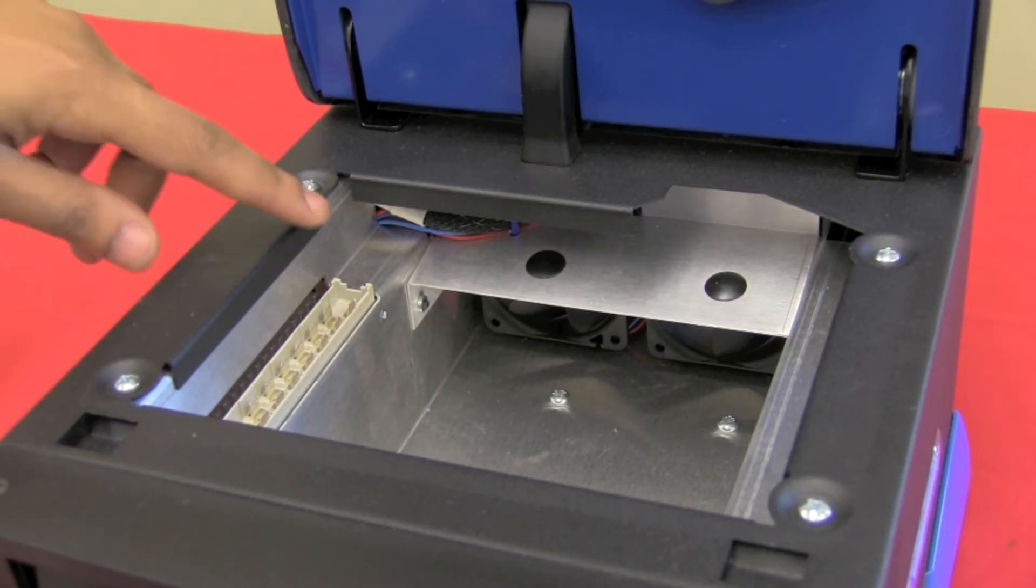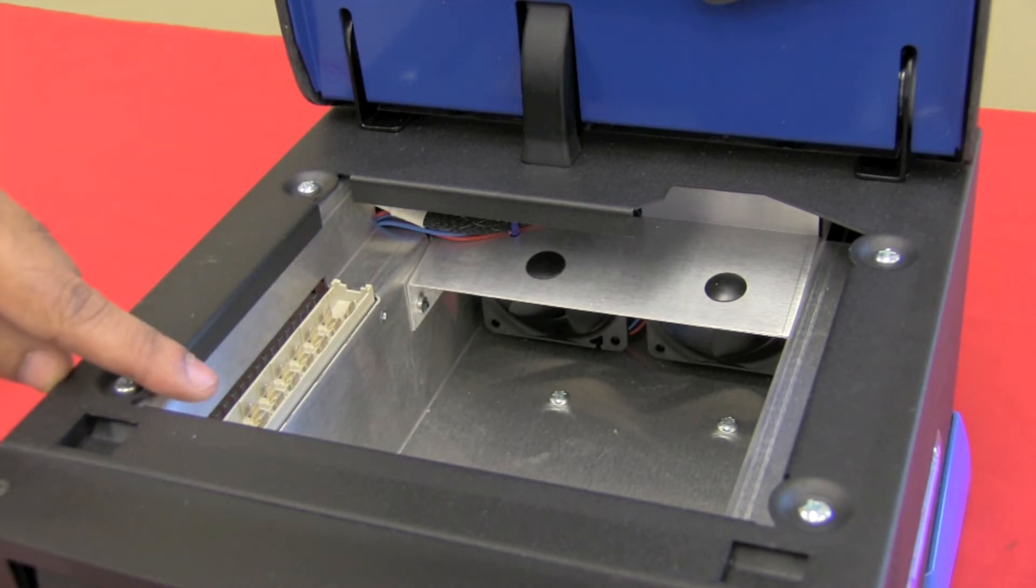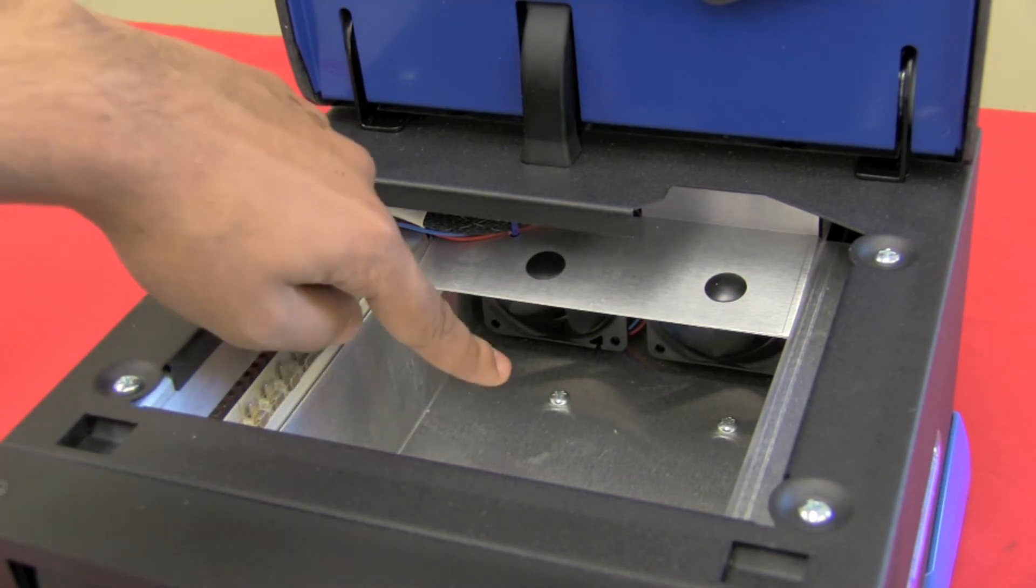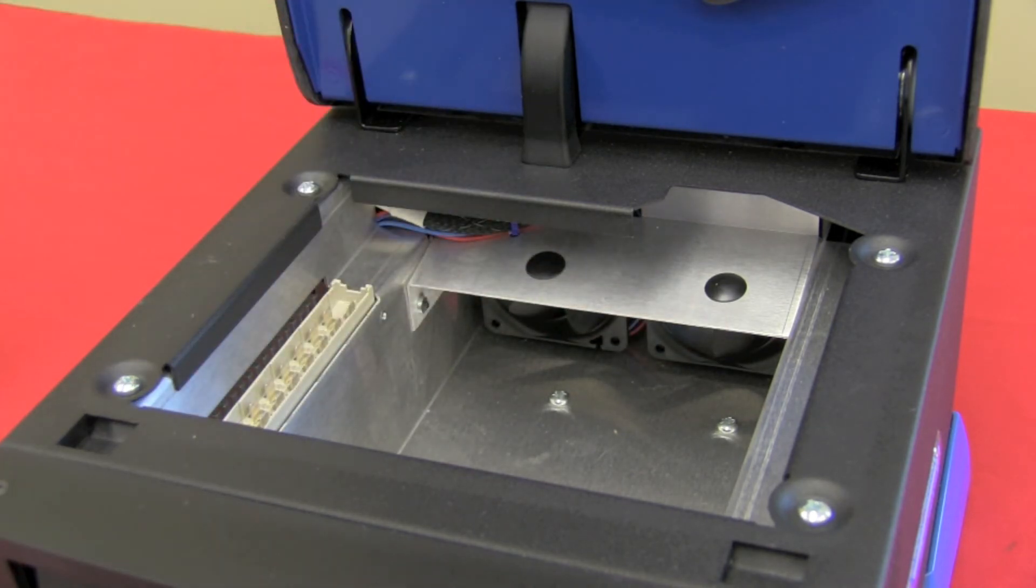Taking a look inside, we can see the connectors for the block here, and it's pretty simple inside. We've got the cooling fans at the back, and that's about it for the inside of the instrument. Very simple.